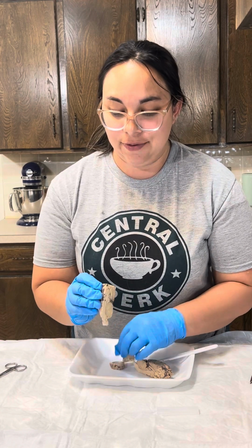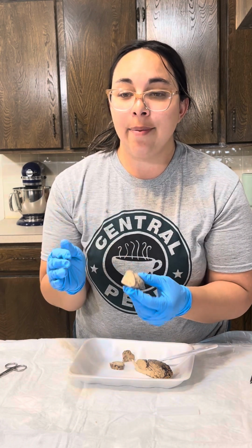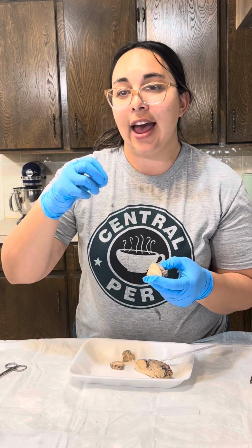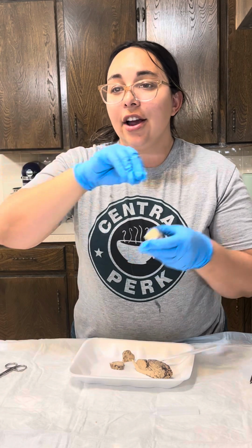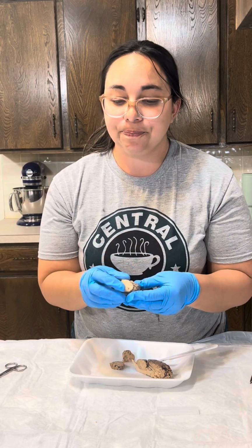In a brain, if you look closely, you can see how some of it is light and some of it is dark. That's white matter and gray matter. Your brain has neurons that fire, and they essentially take all the information from one place to the other.